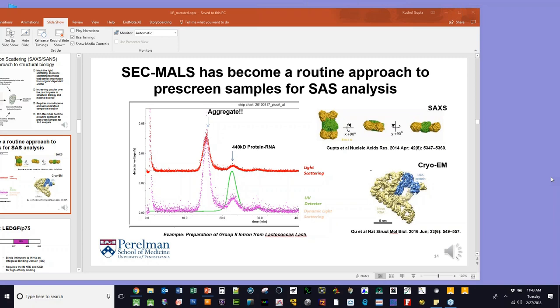That's usually evidenced by some type of mass profile across the peak. All right, is it a steadfast flat line, or is it something that's sloping upwards with concentration? And I'll use that information a lot in interpreting and restraining our interpretation of results. For example, if I'm doing sedimentation equilibrium analysis, and I'm fitting different association models to a given data set, right? Knowing that I see a certain mass profile in my SEC-MALS data can help me eliminate models to test against sedimentation equilibrium analysis.